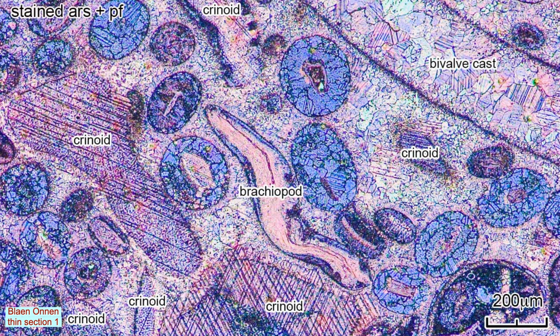A group of ooids from this section are now examined more closely. The ooid cortices are composed of equant, inclusion-rich crystals with irregular intercrystalline boundaries. The intergranular pores have radially arranged elongate calcite crystals against the ooids' surfaces that merge into fewer crystals tens of microns wide at the center of larger pores.